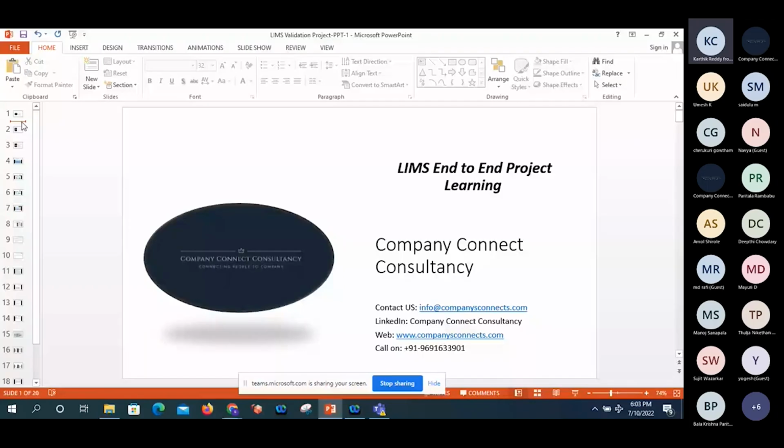Today, I would like to explain about the LIMS end-to-end project learning. So please listen carefully. If you have any doubts, please keep them on your side and ask me after completion of this session. This session would be around 30 to 40 minutes. So please concentrate on what I'm explaining. After that, you can ask whatever questions you have.